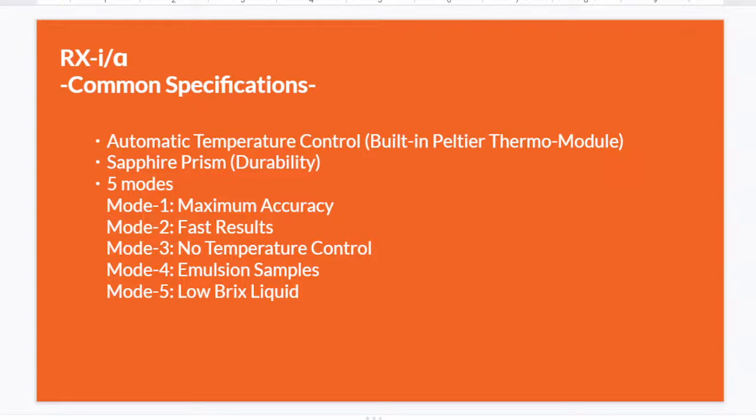The Rx series has a sapphire prism, which PAL and MASTER don't, giving it more durability. Both models also have five measurement modes. You can change the mode depending on whether you want fast results or are measuring a low Brix sample, but most people use mode one, which is the most normal mode.